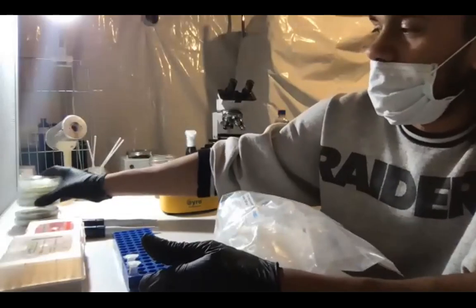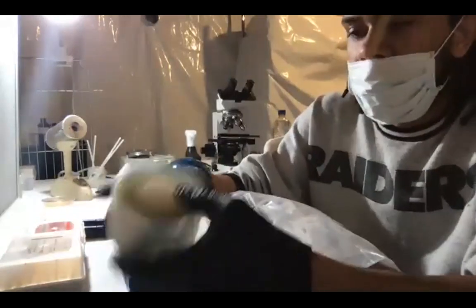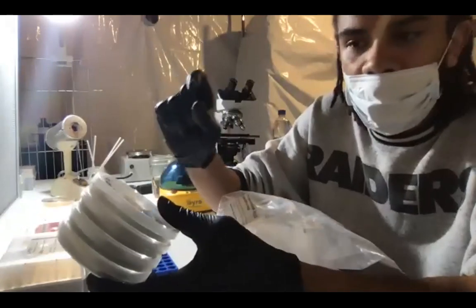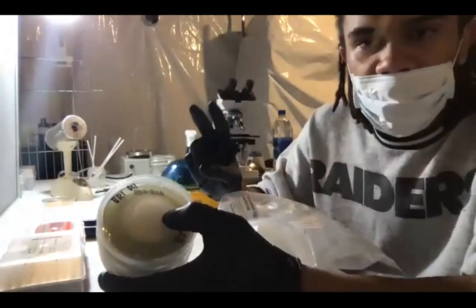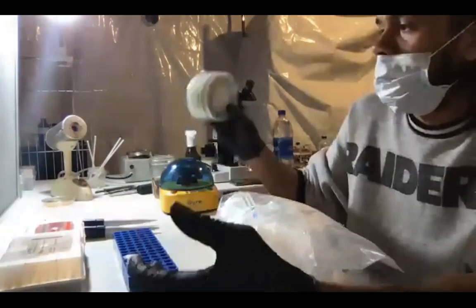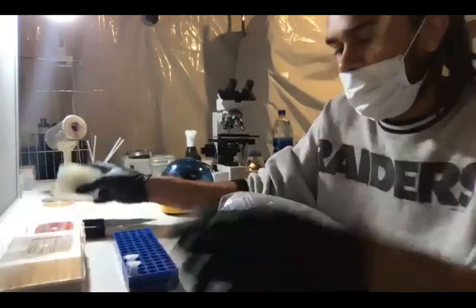So basically the results that we're looking for is, for each of these, we can only do 4 at a time because I can only run 8 samples in my PCR. That's another reason why I want to get a bigger PCR than just 8. And the reason that we can only do 4 at a time is because we have to test each of these for both potential mating types. So ideally we want only one mating type to show up in our results at the end. If there's 2 mating types, that means that you messed up with your isolations and they already combined with another spore. So hopefully that doesn't happen with any of these, but I did get to these a little bit late, so they potentially might have already mated.